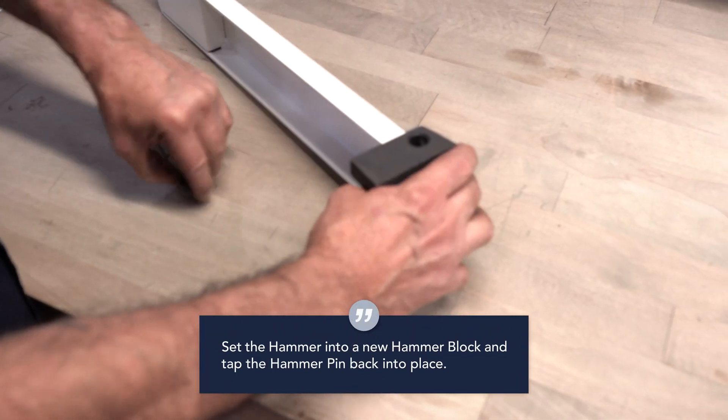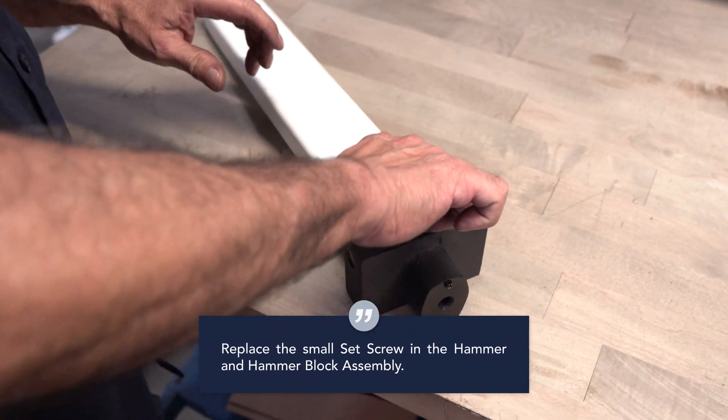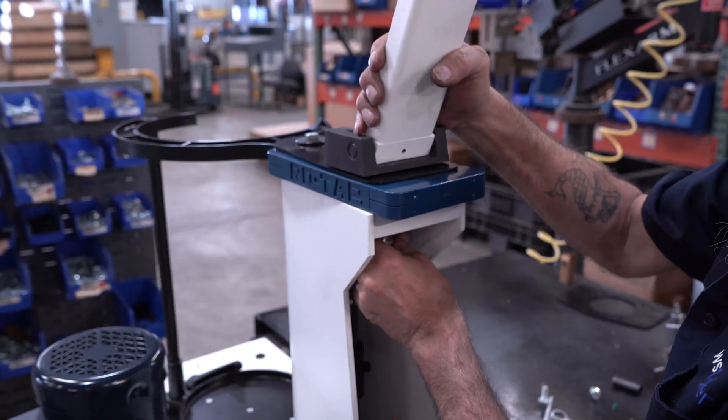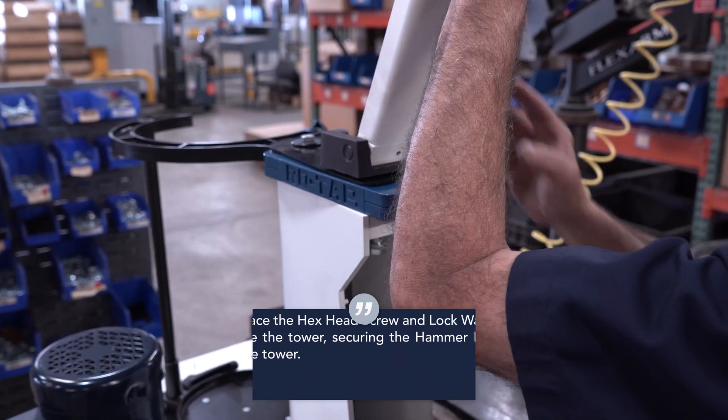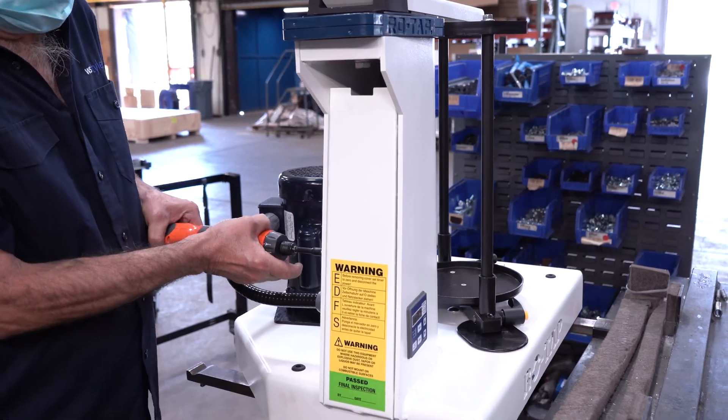Set the hammer into the new hammer block and tap the hammer pin back into place. Replace the small set screw in the hammer and hammer block assembly. Replace the hex head screw and lock washer inside the tower, securing the hammer block to the tower. Replace and secure the pedestal cover.